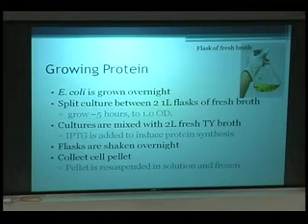So we start with growing protein. And so we grow E. coli cells overnight, in a small amount. It's special E. coli that we've transformed, so it has this plasmid in it, so that the bacteria will express the gene that will make Dpo-4, because Dpo-4 is not naturally occurring in E. coli. Then basically the rest of these steps, we start off with about 10 milliliters, and we end up with 4 liters. And it takes like 3 days.